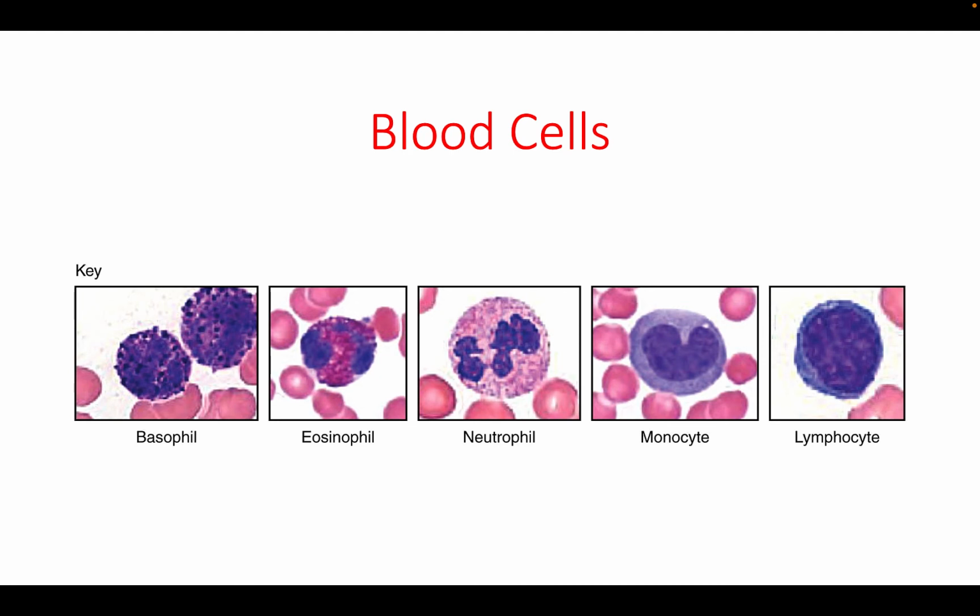Kind of difficult to determine all these, but when you're looking at the white blood cells, what can you distinguish from their nuclei? That's how you distinguish these white blood cells. We don't need to know the functions for them, as this is just the anatomy portion of the class. The functions will be covered in lecture.